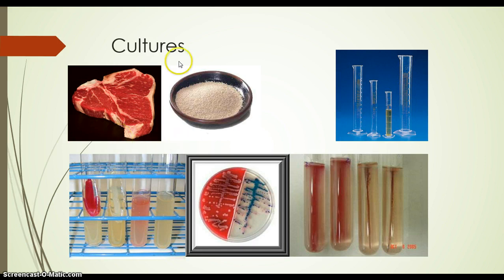So you have a complex plate medium, and then you have the broth medium, in that you can grow and measure the turbidity and other things as well. We'll get to that later. Slants, plates, and deeps all have the consistency of jelly, as you've recognized, relative to the broths. That's because of the agar in there.